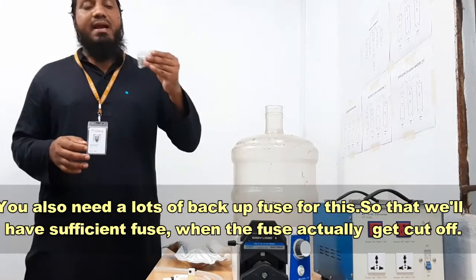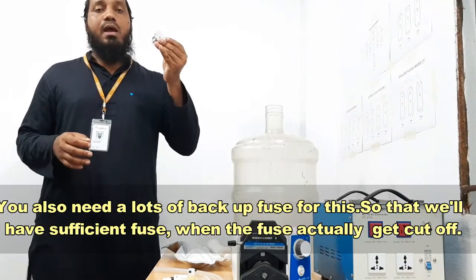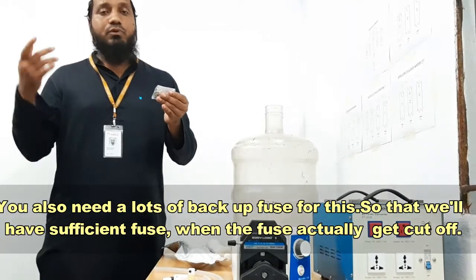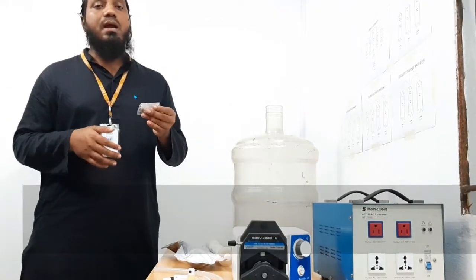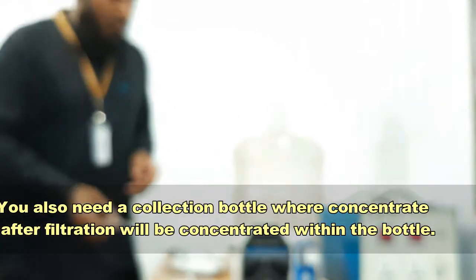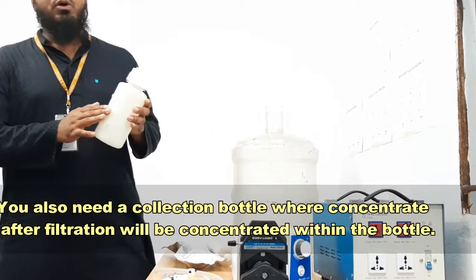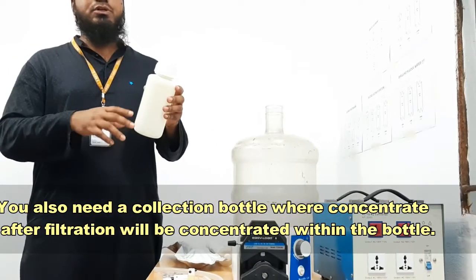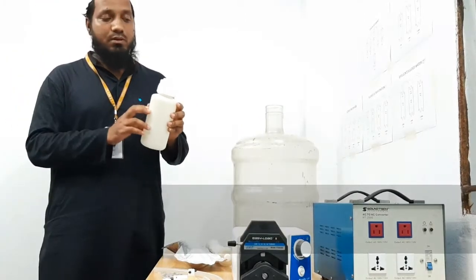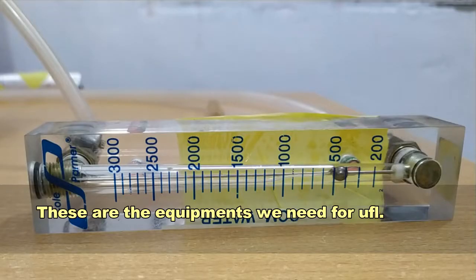You also need to keep lots of backup fuses so that you have sufficient replacements when a fuse is cut. You also need a collection bottle where the concentrate after filtration is collected — the water is concentrated significantly in this bottle. These are all the equipment we need for ultrafiltration.